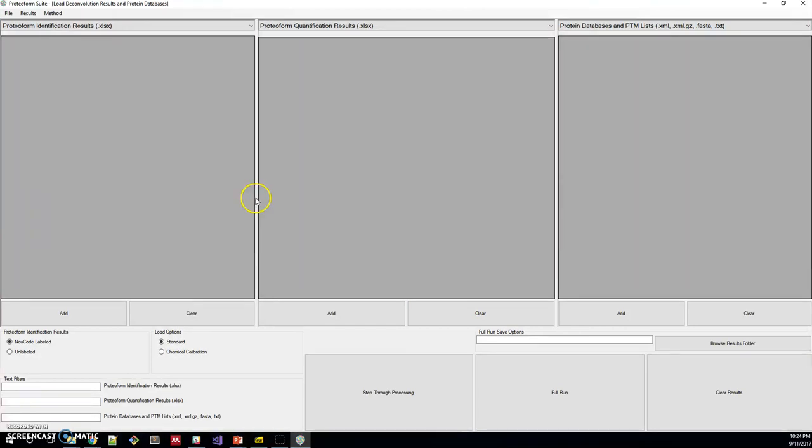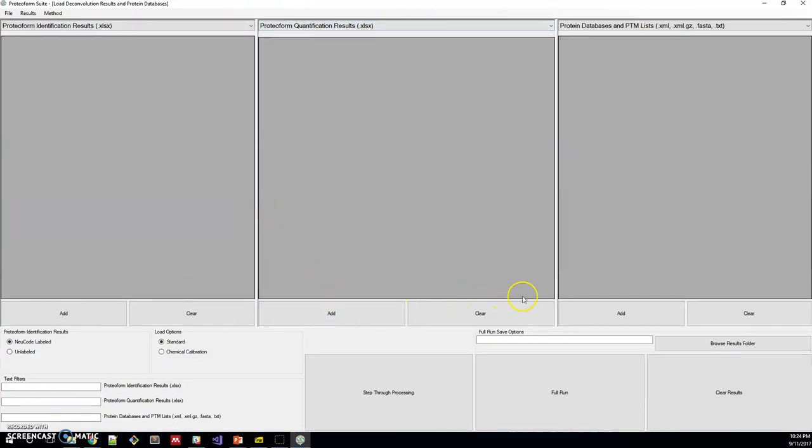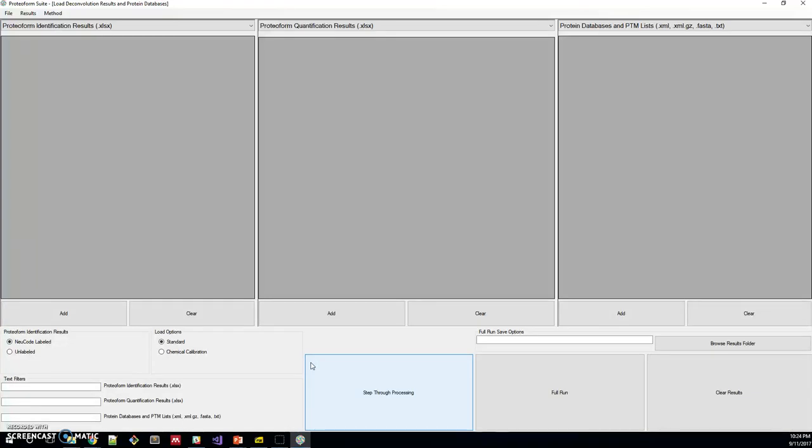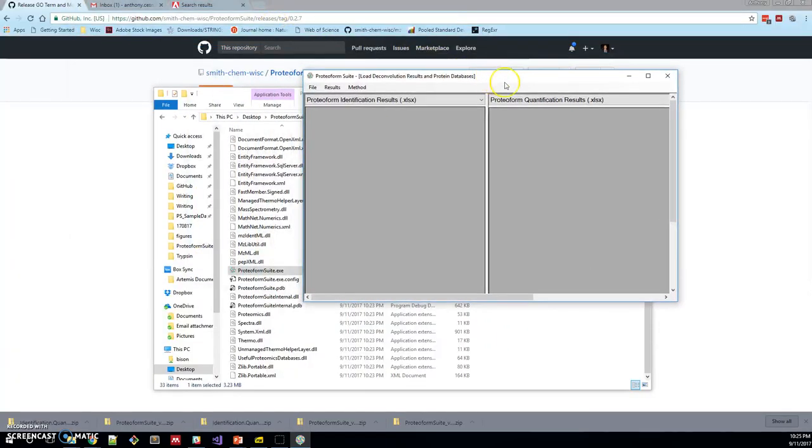This is Proteoform Suite. You can see that there's this identification results frame, a quantification results frame, and then there's a protein databases and PTM list frame. Down below, there are some options for running through the processing of the data.